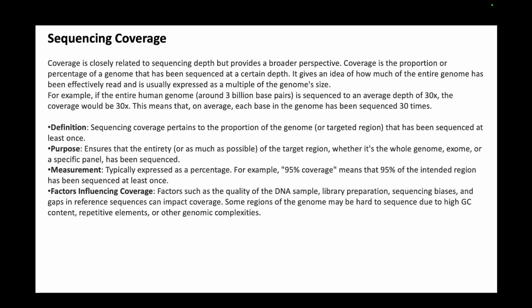Quality of the DNA sample, which is very obvious, library preparation, and sequencing biases. There can be biases in your base calling software, which can introduce errors in the sequence generated. Sequencing biases and gaps in reference sequences can impact coverage as well.